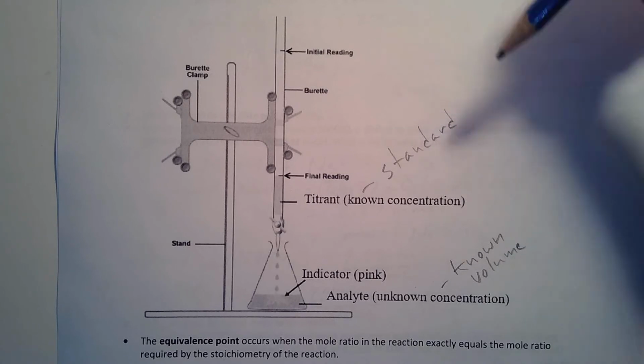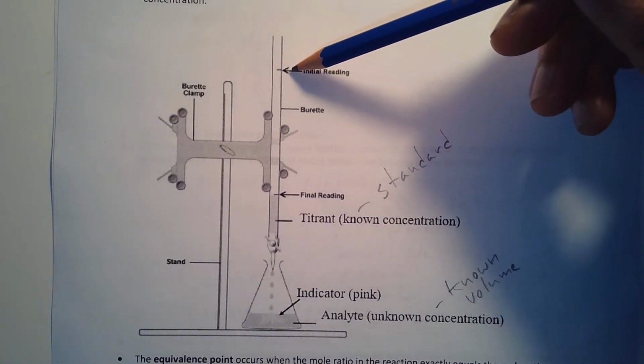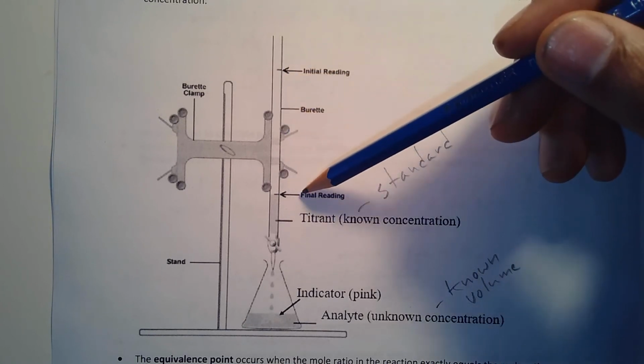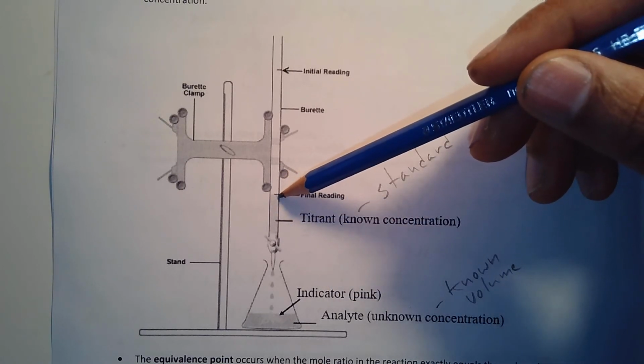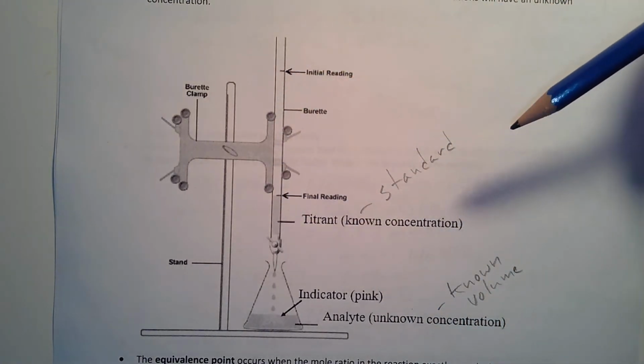Now, with the burette, you'll have some initial reading here. Let's say this is like 15 milliliters, and then it'll drain out until you get to the end point by monitoring the color, and then you look at whatever the reading is here. Let's say this is 45 milliliters. Then you say, okay, we used 30 milliliters.